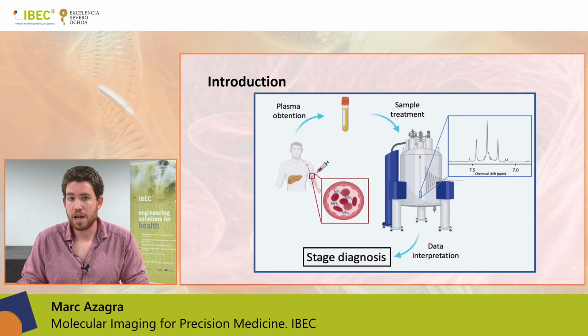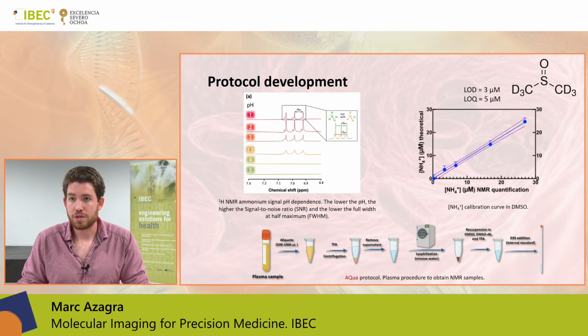So this is the aim of the project. We started with the plasma obtention, then we did the proper sample treatment to achieve an accurate quantification using proton NMR, and finally the data interpretation for the diagnostic stage. This was the protocol development.